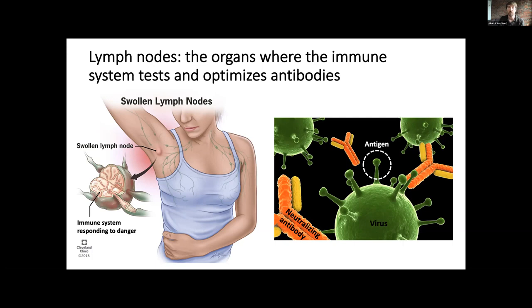For my own project testing new HIV vaccine designs, I modified an HIV antigen with a fluorescent dye to make it glow under certain kinds of light. This modification allowed us to track the antigen to see how much is getting into lymph nodes, and this is one of the methods we use in the Irvine lab to compare and contrast different vaccine designs.